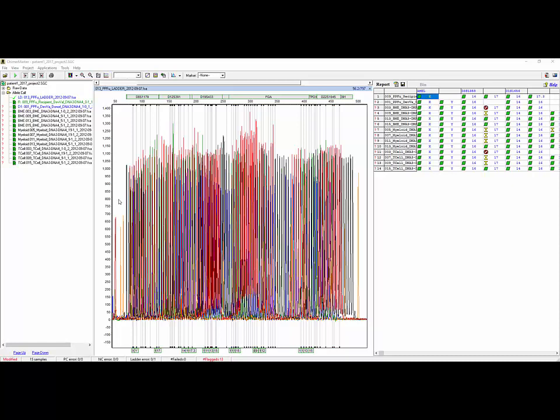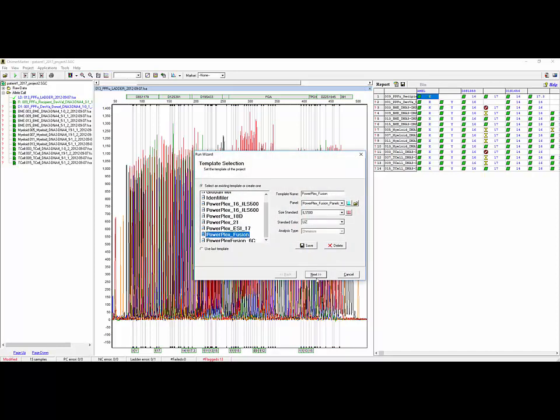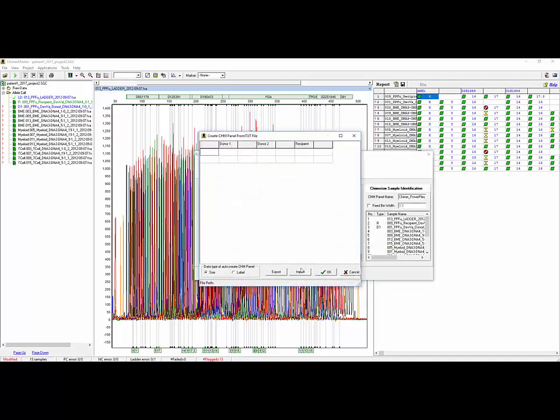If you have the donor and recipient genotype saved in an Excel file or in a text file of some kind, we do actually have a tool called the Text Import tool, which is on the second page of the Run Wizard. It allows you to upload the genotypes of the donor and recipient files in the form of a text file. So those projects can actually be accommodated in ChimerMarker, and you can analyze them fully again if you have the genotype saved, but don't necessarily have them in the .FSA or .HID files. And please view the separate webinar for more information about the Text Import tool.